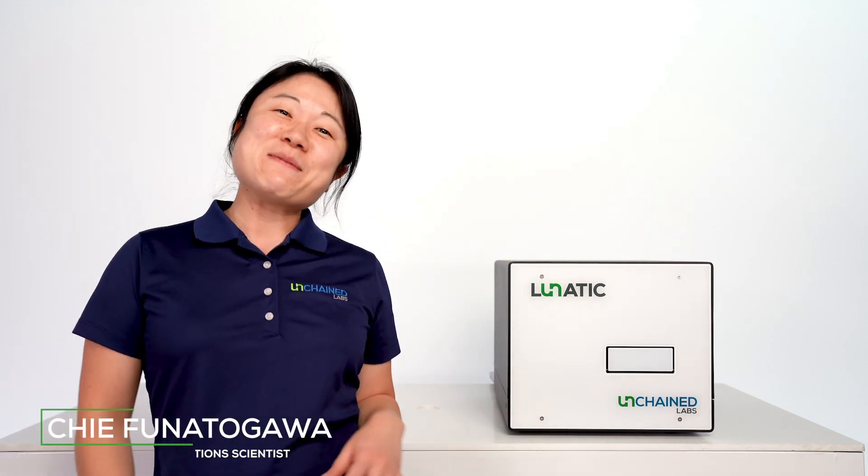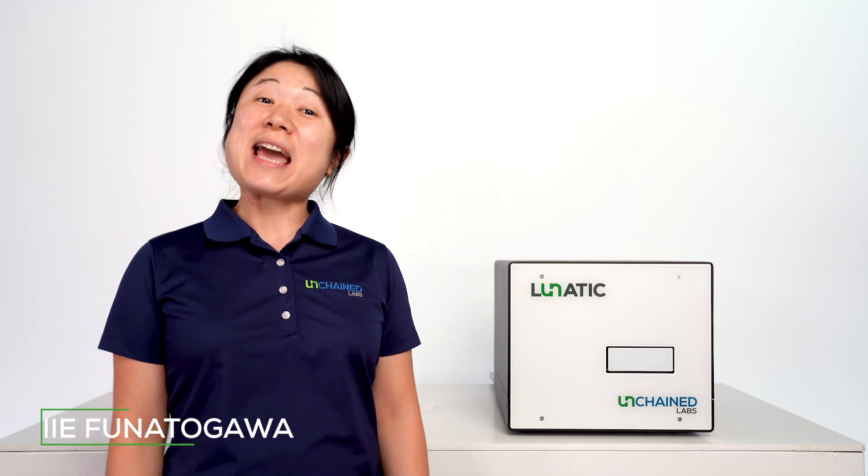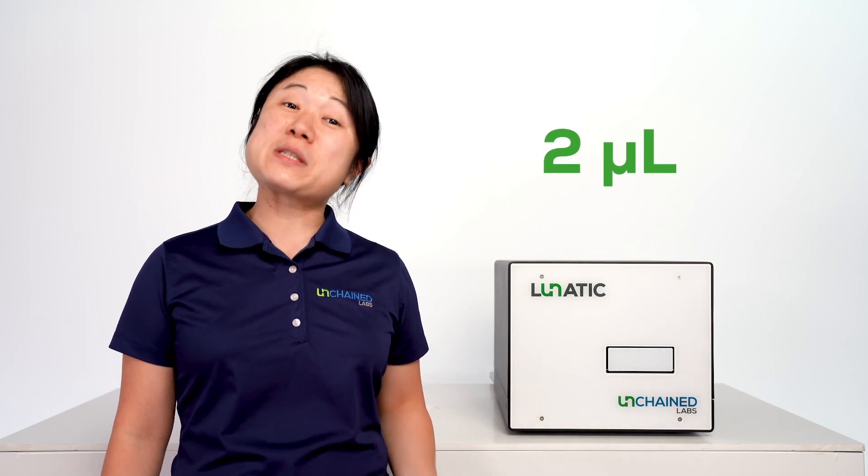Hi, I'm Chia. I'm here to tell you about the Fundamentals Kit for Big Lunatic, the only high-throughput 96-well UV-Vis system that uses just 2 microliters of sample to give you spot-on protein and DNA quantification.